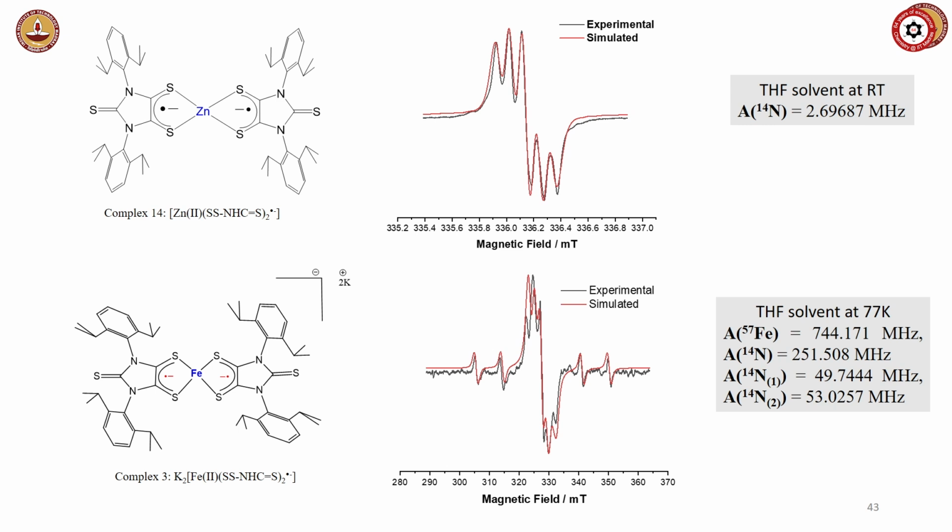So when we measure the magnetic property, this molecule has two types of state. In one case both spins are parallel, in the other one is up and the other down. When we do magnetic measurement, we get a magnetic moment that comes to half. So it has two types of spin state, one singlet and another triplet. We get the EPR signal for the triplet, and this triplet species gives the coupling constants, and also this compound gives an NMR signal, which is for the singlet species.